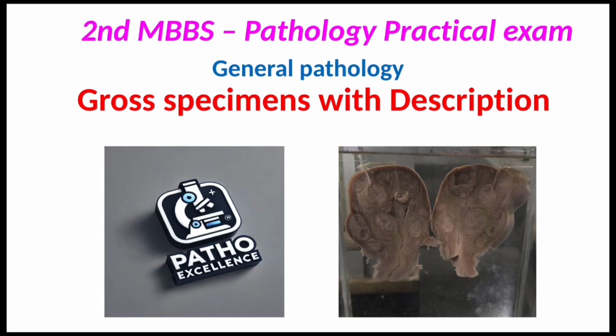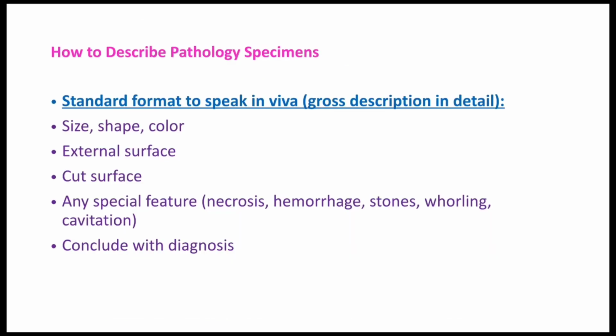In this pathology practical exam video series, today we are going to discuss gross specimens of general pathology, which is the syllabus of the first internal examination. So in this video, we will discuss all the gross specimens related to general pathology only.